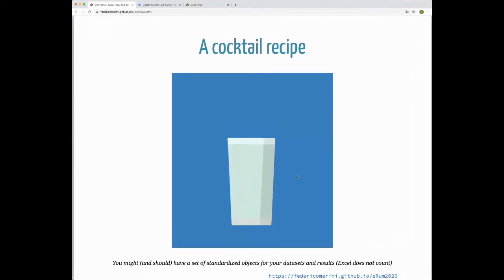So I have a recipe for you that I would like to try to test. If you have nice bioinformatic partners, you might, and probably should, get your dataset given to you in some kind of standardized format. And no, Excel does not belong to this category. What you're going to need is, for example, a container for your expression matrix, this DESeqDataSet object, a container for the result of differential expression, and a table for the result of functional enrichment analysis, this so-called pathway analysis that can give you some kind of hint of what goes on at the higher level.